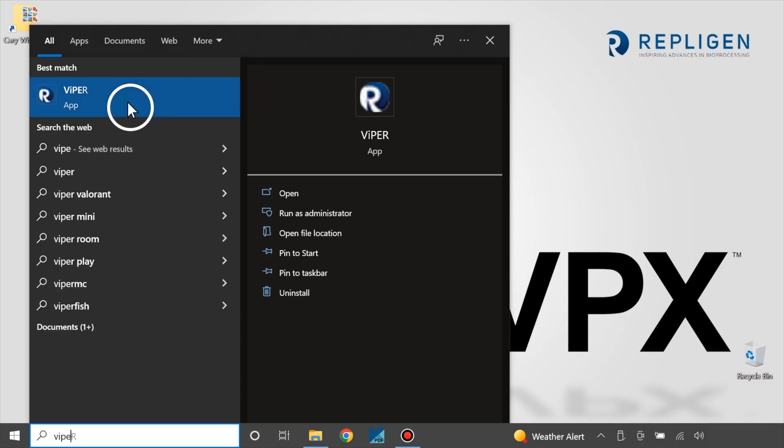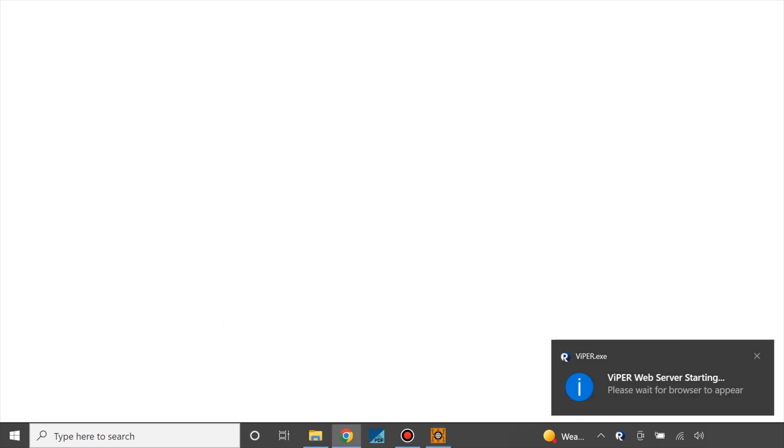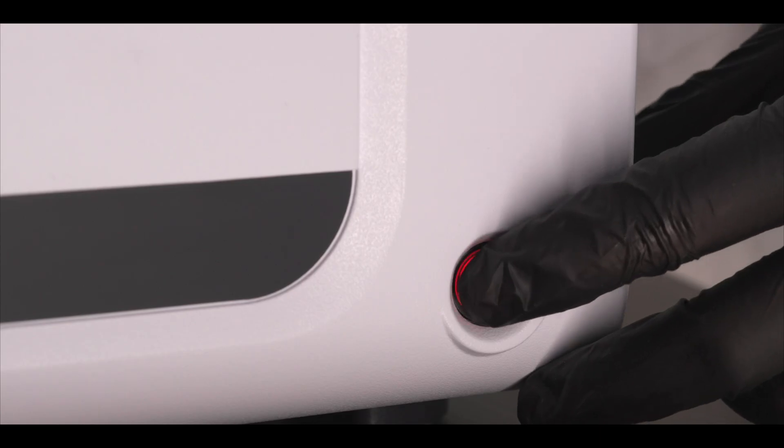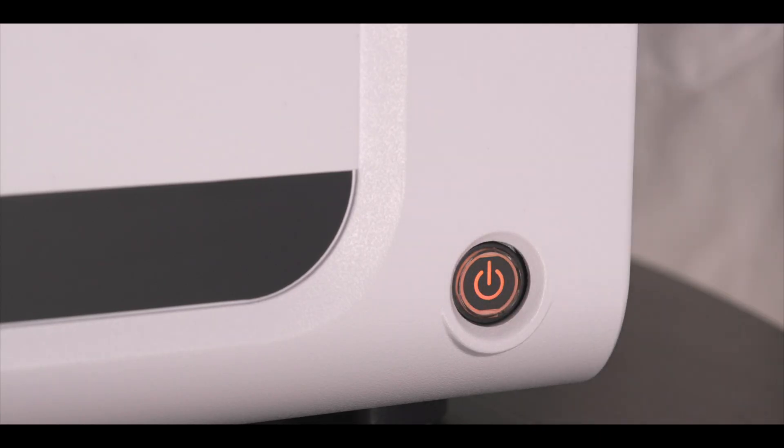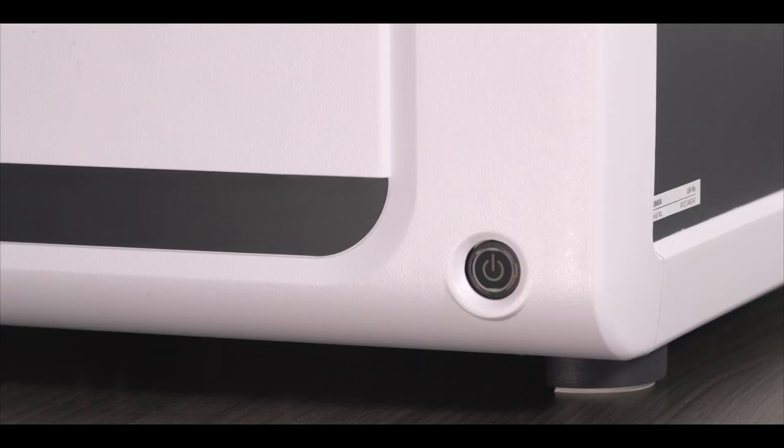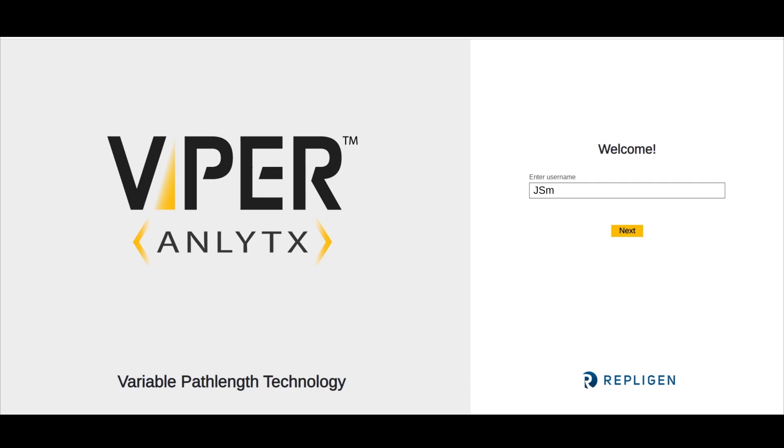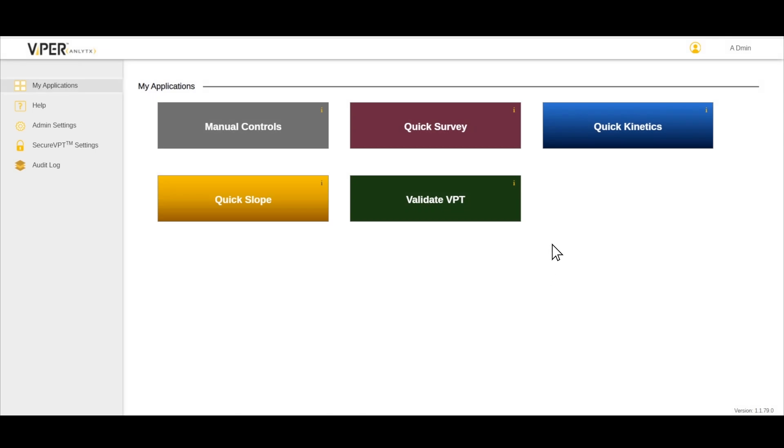Run the Viper software on the computer by double clicking the program icon located on the desktop. The console will run calibrations in the background. Before running any processes in the software, ensure the console says ready and the Cary 60 power button is green. Enter your username and password in the indicated fields.